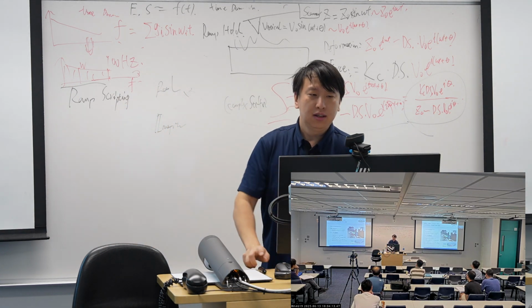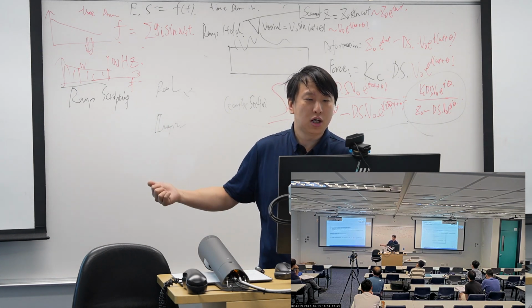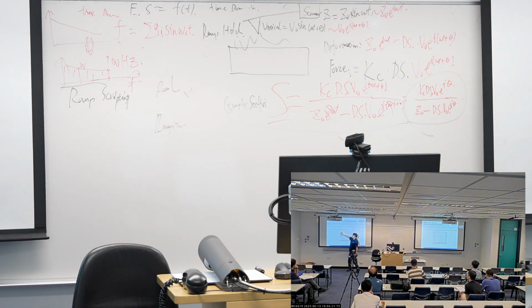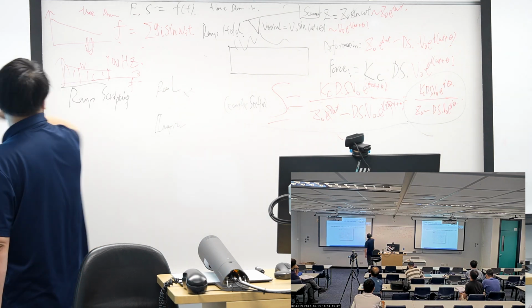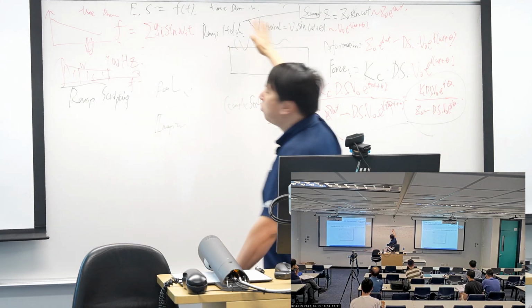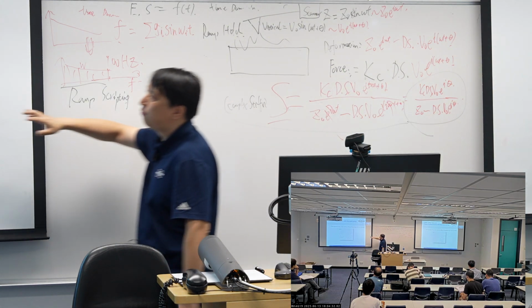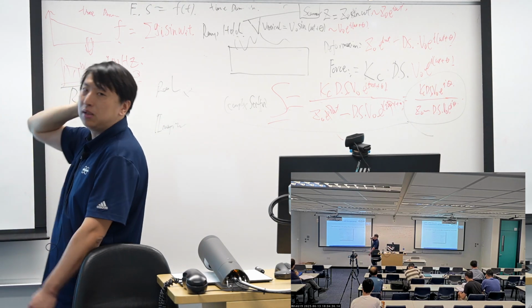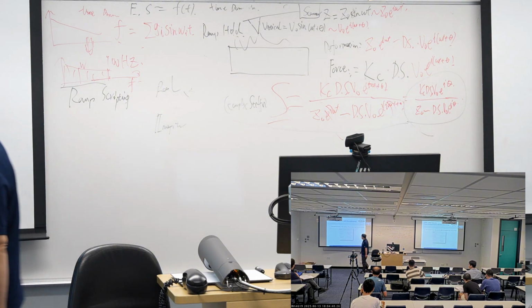So finally, I will jump to the software first. We will do the ramp scripting game. In the ramp scripting, we need to define how the probe touches the surface, and then we will do a series of frequencies, not just one, but 10, or 20, or 100, as much as you want.